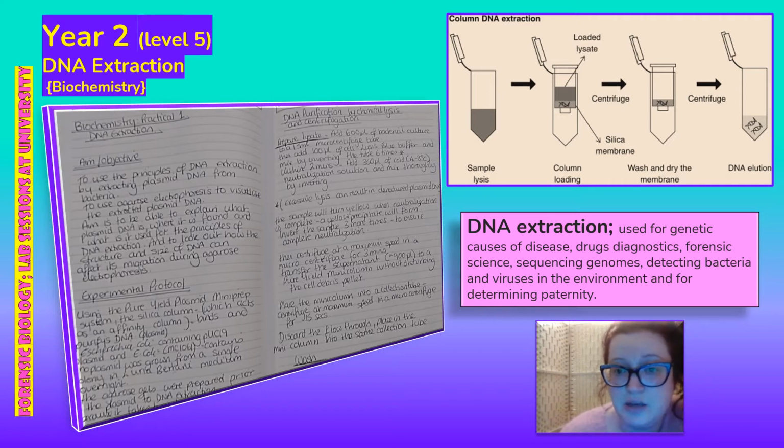And here you can see an example where you see if you've got a DNA sample. So you could say there's some DNA at a crime scene, and obviously you can't pick up pure DNA. There's no such thing. It's messed up with everything that's on it. It could be on the ground, could be mixed with other people's DNA. So the sample will be put into a little test tube, and then it would be put into a centrifuge, which is the machine that goes really, really fast, okay? And it spins, and by the way it's spinning, it's actually washing and drying and separating the different parts of the DNA.